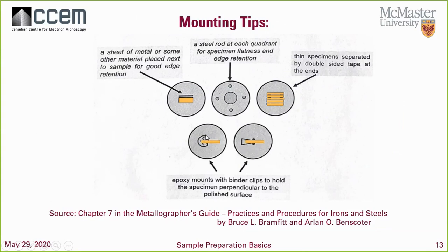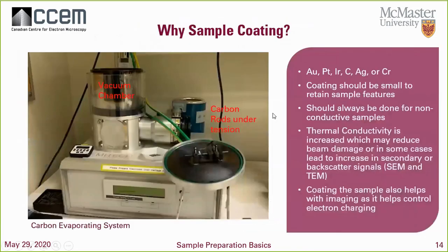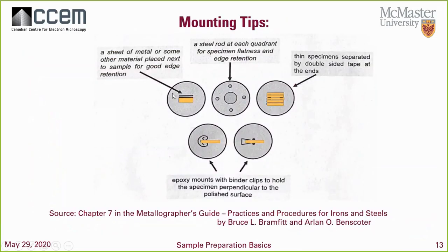Now, I would recommend adding metallic inserts rather than the plastics, so that way you don't have to add any extra conductive coating or conductive paint, right? Also, you can add metallic particles to these mounts so that you can just have a completely conductive mount and not have to worry about coating them afterwards.